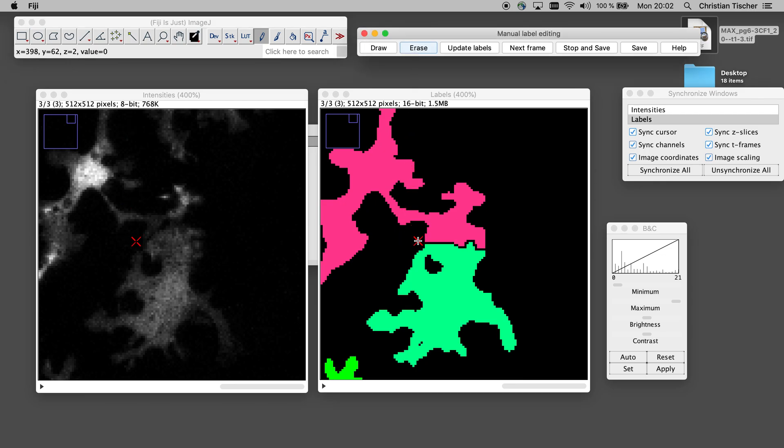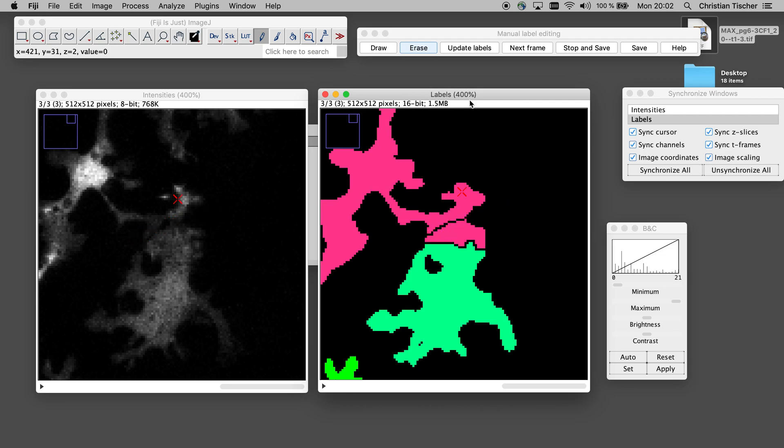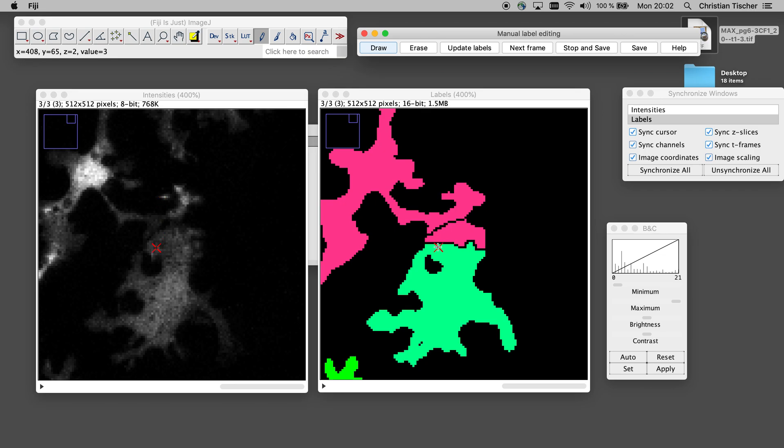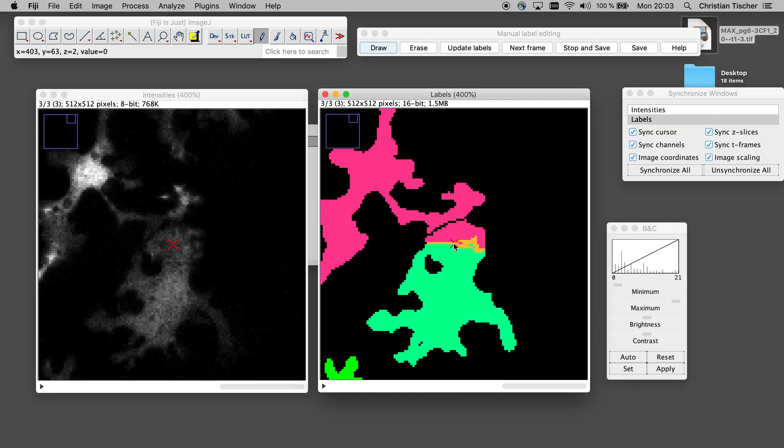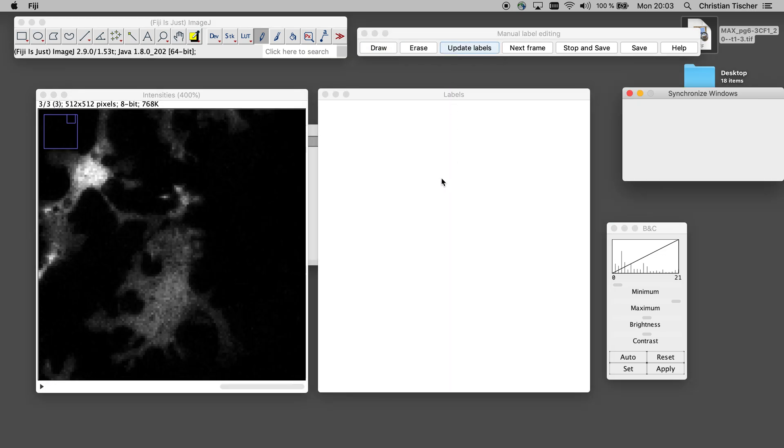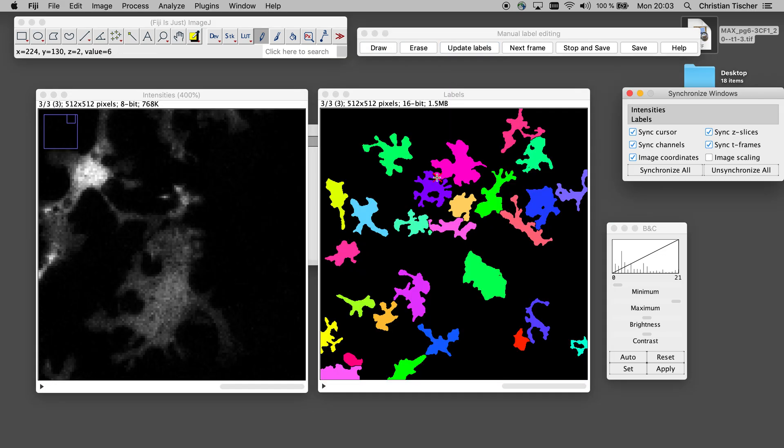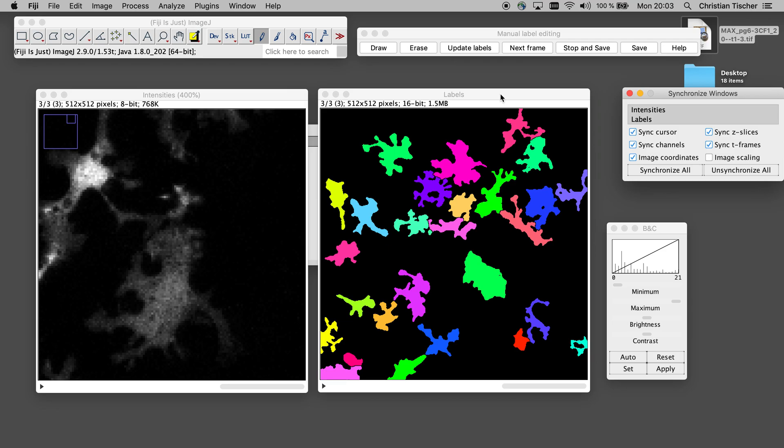So I want to cut here and join here. Again, this doesn't matter what the color is. Okay, update labels. And I successfully fix the segmentation here.